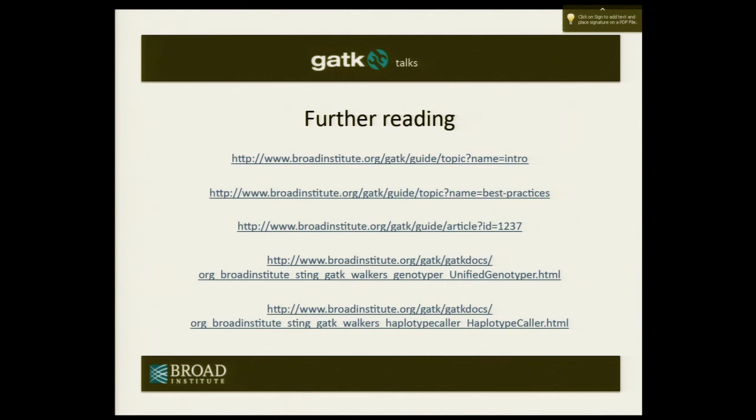So it differentiates. When BWA soft clips, you can turn on quality soft clipping, versus if there are indels towards the end of the read, it'll soft clip. It won't take longer when you have soft clipping by quality score. Are you talking about this Q2 specific thing? Q2 is a special code by either BWA or Illumina.